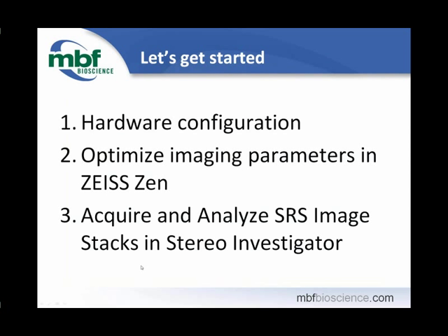To give you a brief outline of what we will do next, Sue and I will be discussing the hardware configurations that are required to perform confocal-based stereology. We'll show you how we work with ZEISS Zen software as well as Stereo Investigator software to optimize the image parameters and then acquire the SRS image stacks.